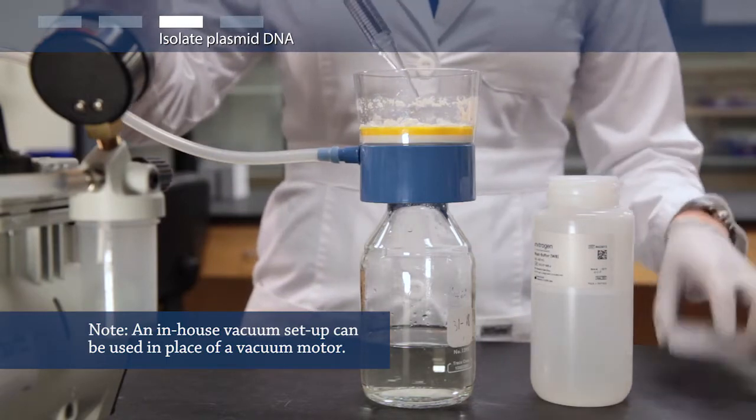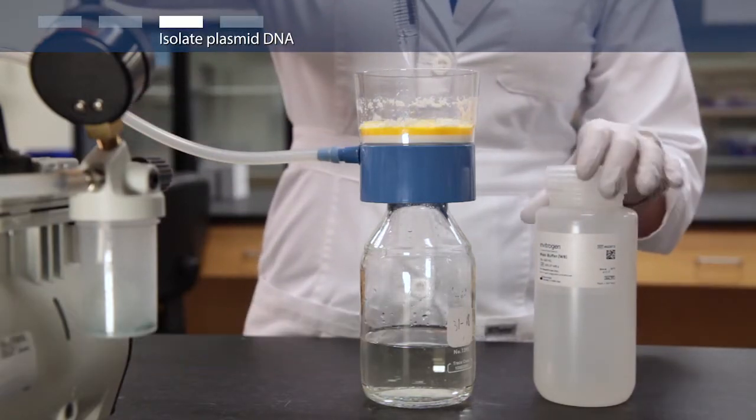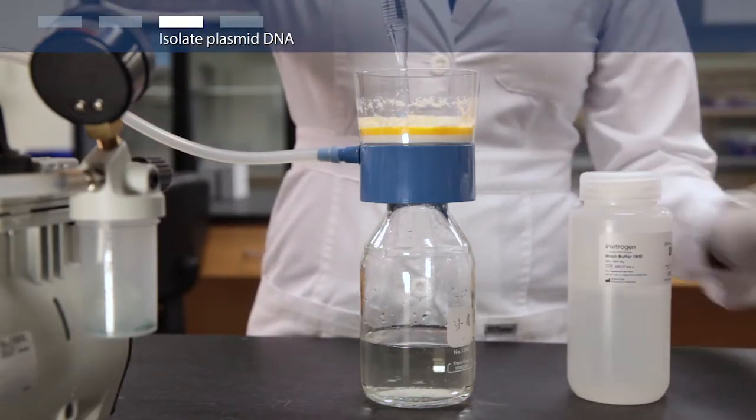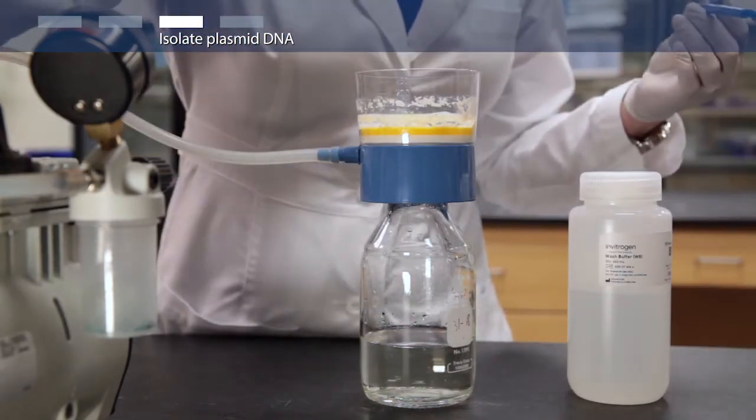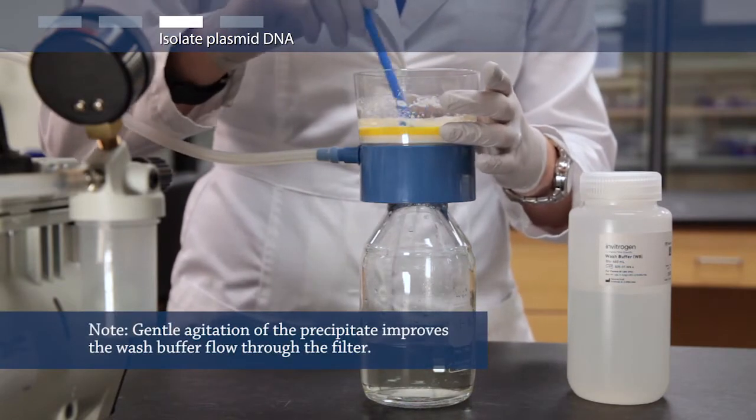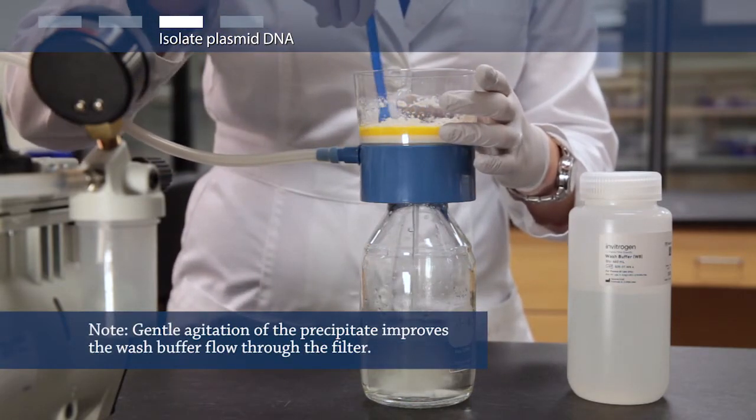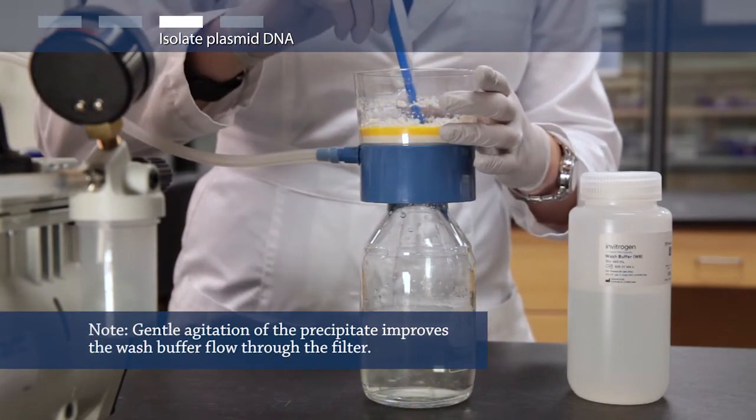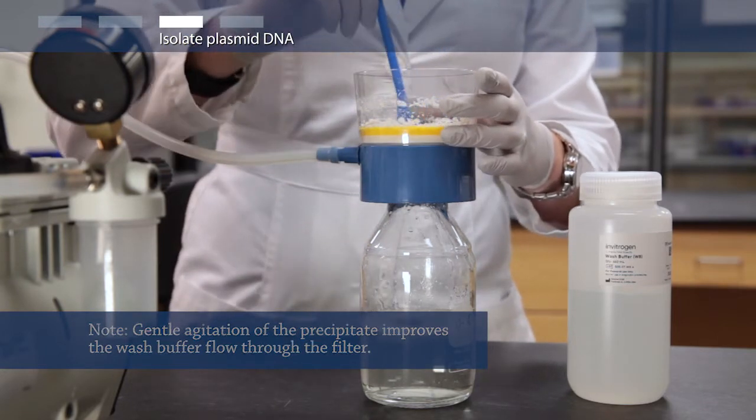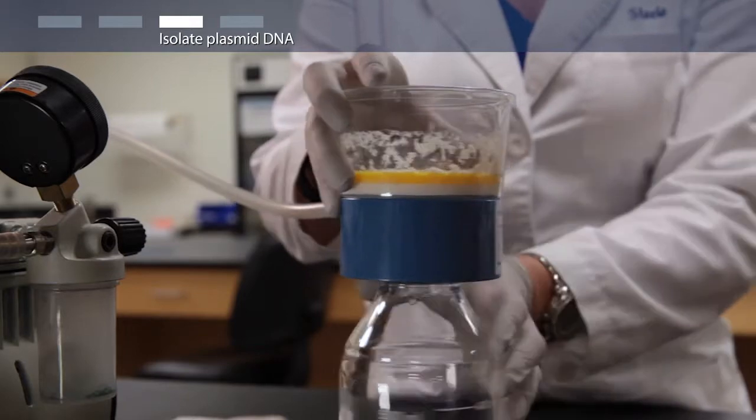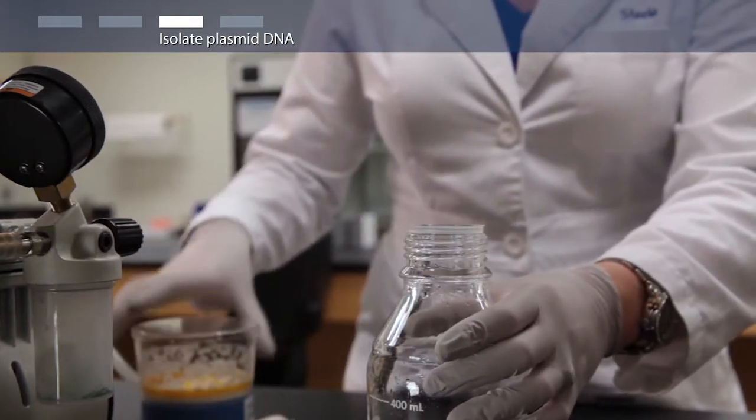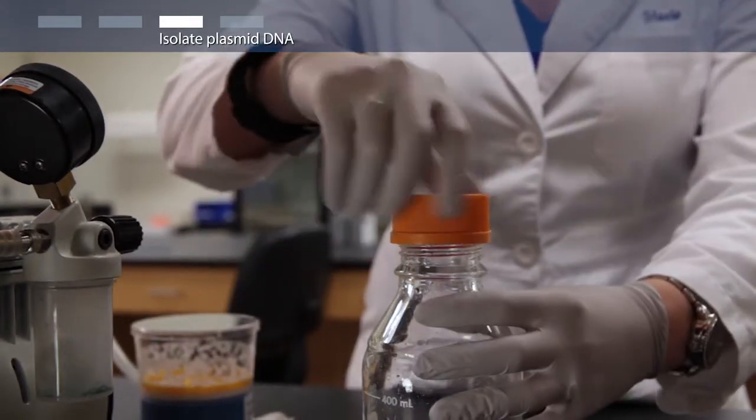Add 50 milliliters of wash buffer and gently stir the precipitate with a spatula while turning on the vacuum. The clarified lysate contains the plasmid DNA. Discard the filtration cartridge.